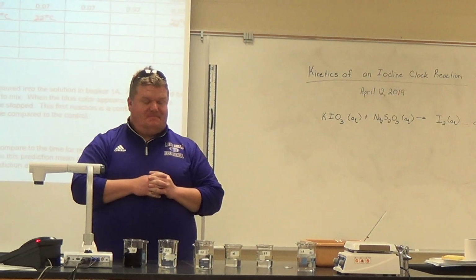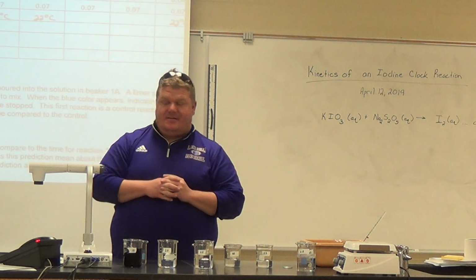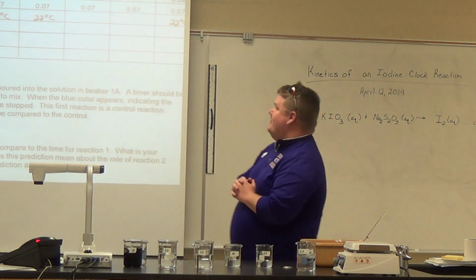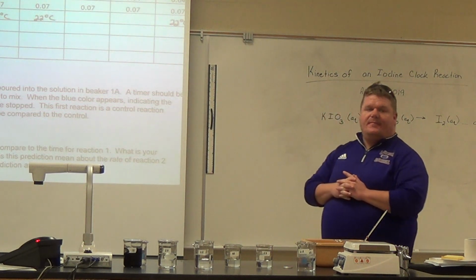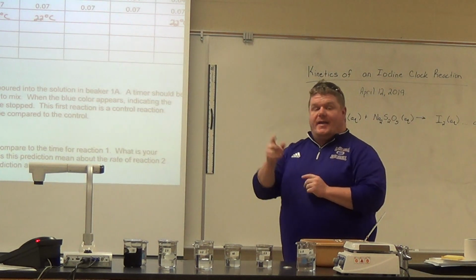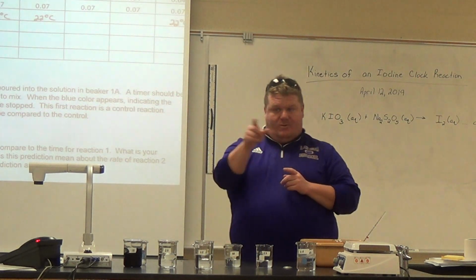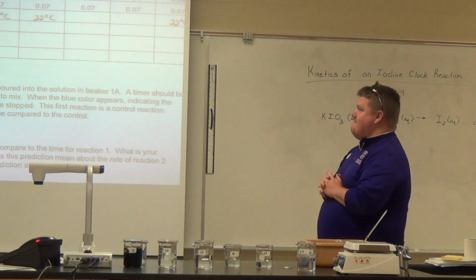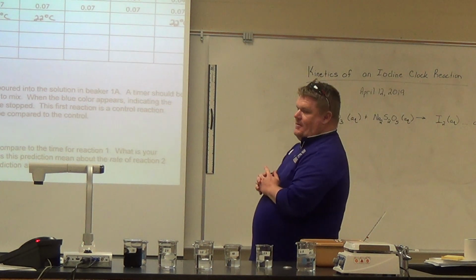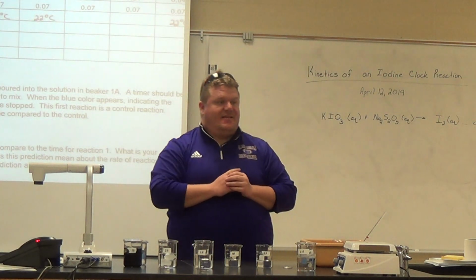I think the rate will stay the same because if you look at the 2 numbers, they're the same. The same as number 1? Well, I get that the concentration is the same as each other, but compare it to number 1, though. Trey, what do you say? I think it's going to be slower because there's more KIO3. Any other predictions? Elizabeth? I think it's going to be faster because there's more gas.